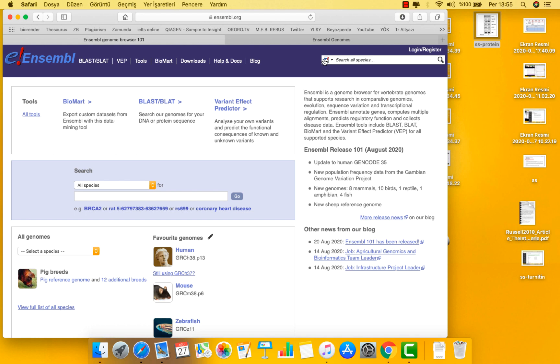There's also a search bar at the top of the homepage that allows you to search all the species in Ensembl for genome coordinates, gene names, probe sets, variation and phenotypes, or regulatory features information.